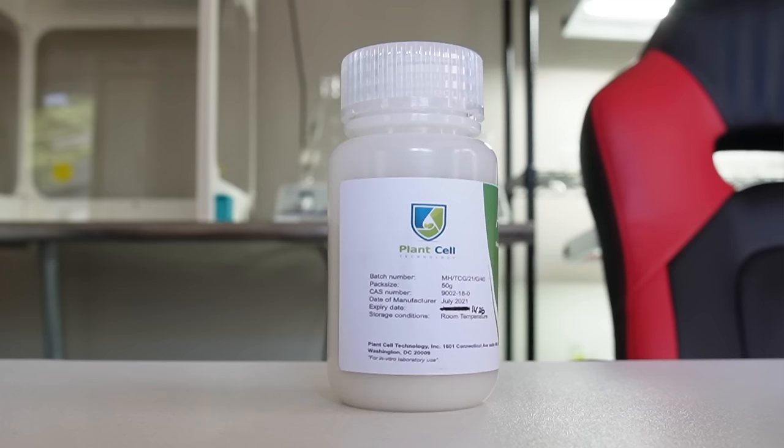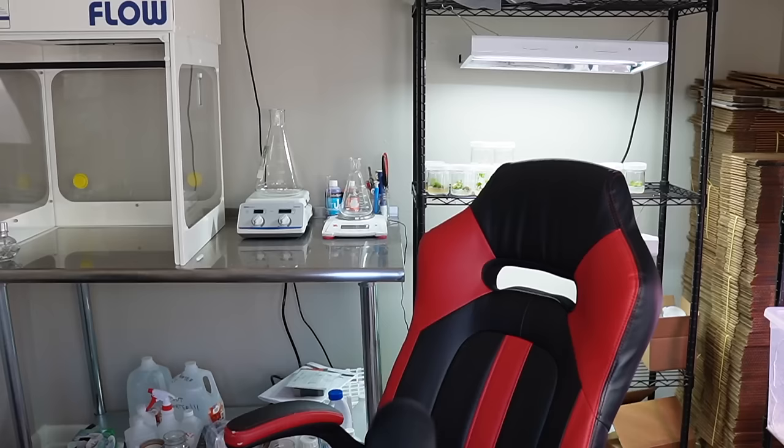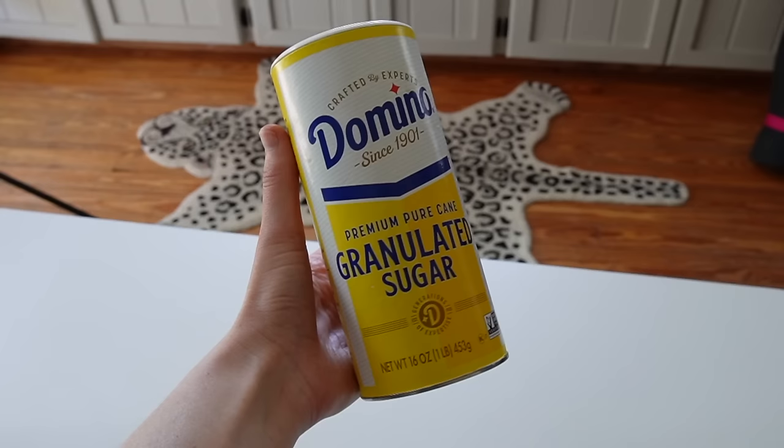The second ingredient is agar, which is the gelling agent that turns the media from a liquid to a solid. Some people use gellan gum instead of agar, which works just as well, but I usually use a technical grade agar from Plant Cell Technology. The third ingredient is sucrose, which is just basic white granulated kitchen sugar.